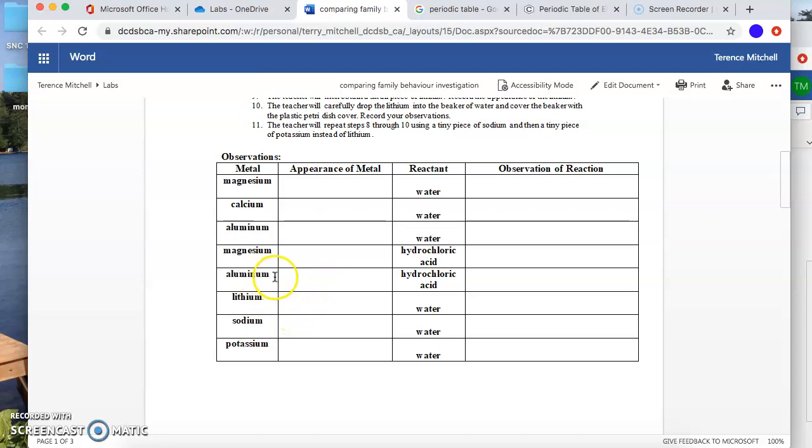And I can't remember, I don't think I show you aluminum and hydrochloric acid, only because I couldn't find a good video of it. All the videos show a lot of hydrochloric acid and a lot of aluminum, and so you would not see that reaction inside the lab. With the aluminum and hydrochloric acid, you see some very light, gentle bubbling. But I'm only giving you a small amount of aluminum, a little piece, half a centimeter by half a centimeter, and 3 or 4 drops of hydrochloric acid. So you do see some really light bubbling, and that's it with those amounts.